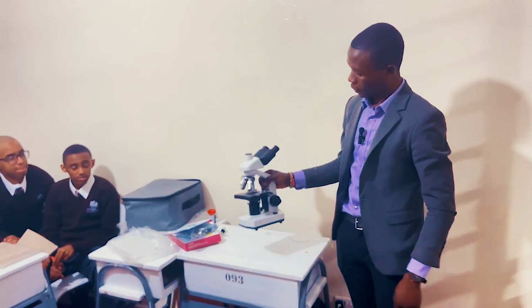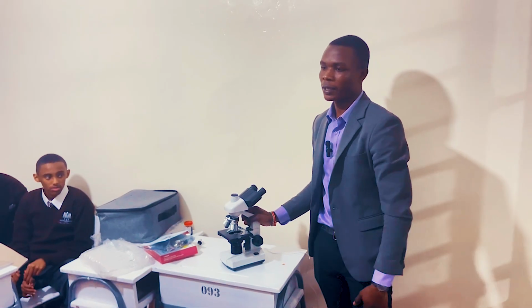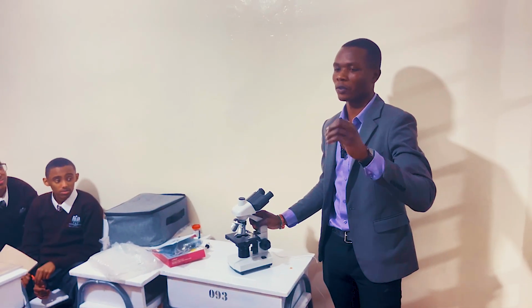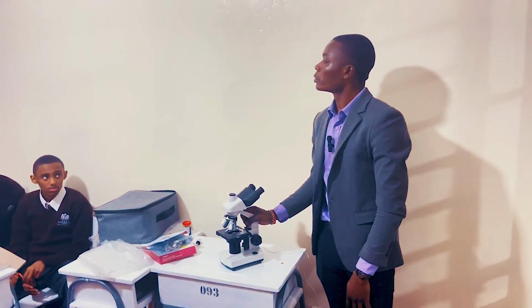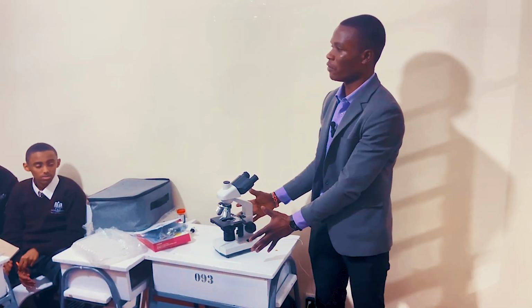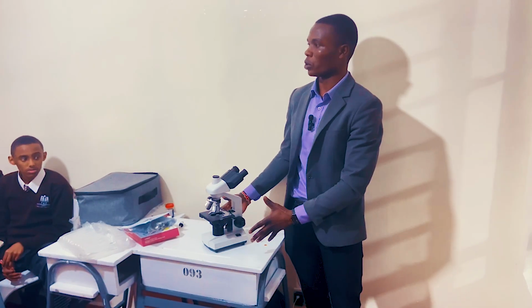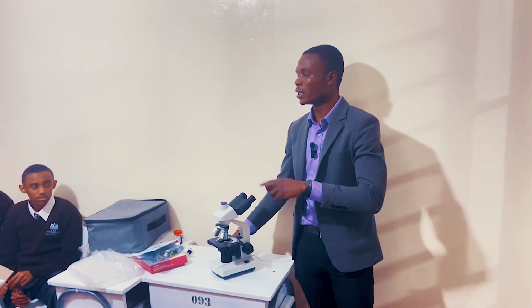So this microscope is a modern one. It has a bulb inside it to improve the visibility of whatever you are going to view under the microscope. Any question up to there? Good. So that one is all about this device. We are through with this device. Now I want us to move to the second thing before we start using it.